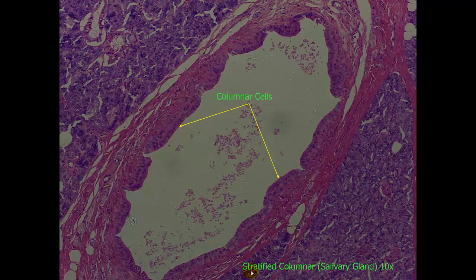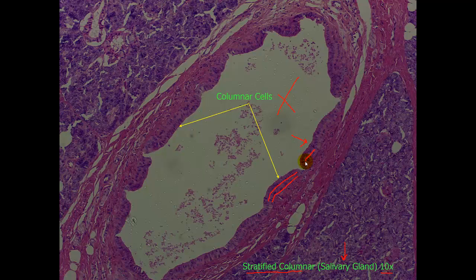The next slide is stratified columnar. This is in a salivary gland at a 10x magnification. This is our lumen, and here is our stratified columnar. One thing to note for stratified columnar: see these rows of things that look like purple dots? Those are actually the nuclei of the cells themselves. Notice how you have some space in between those nuclei. This is going to help to differentiate it from pseudostratified columnar, which I will point out in a little bit.